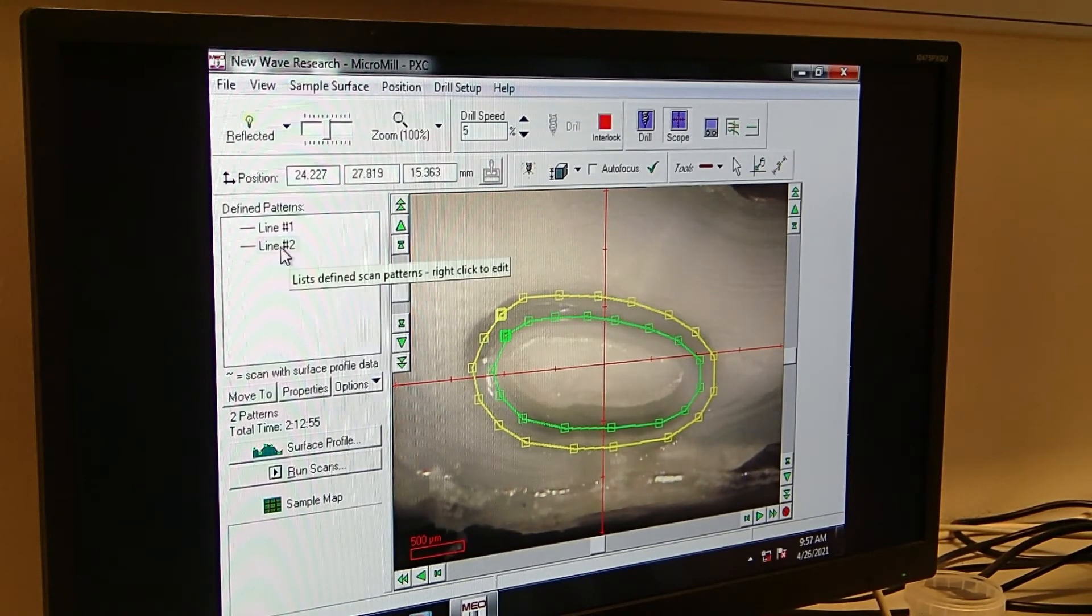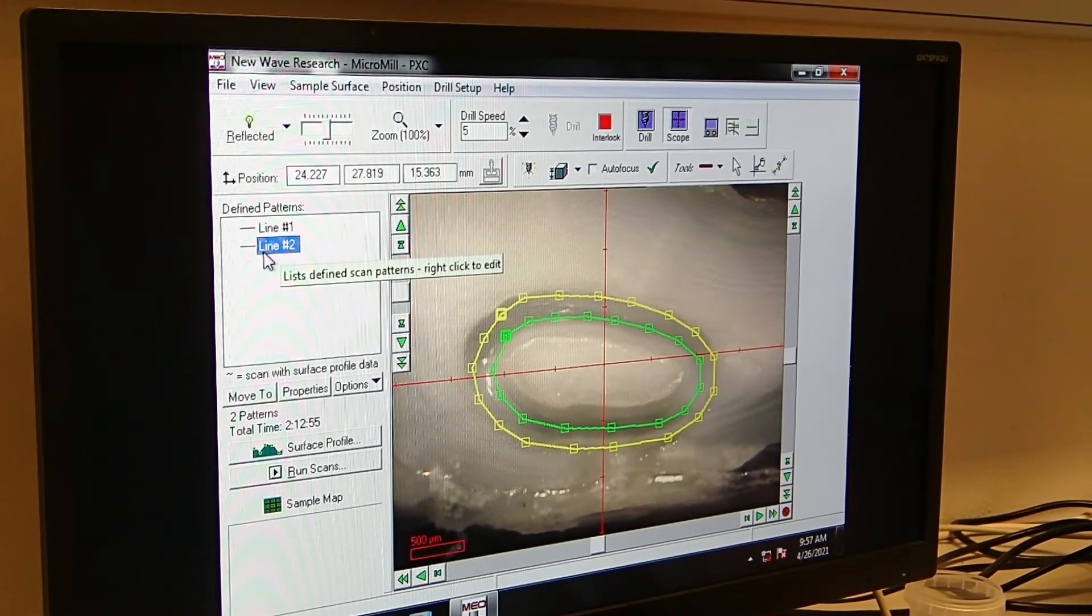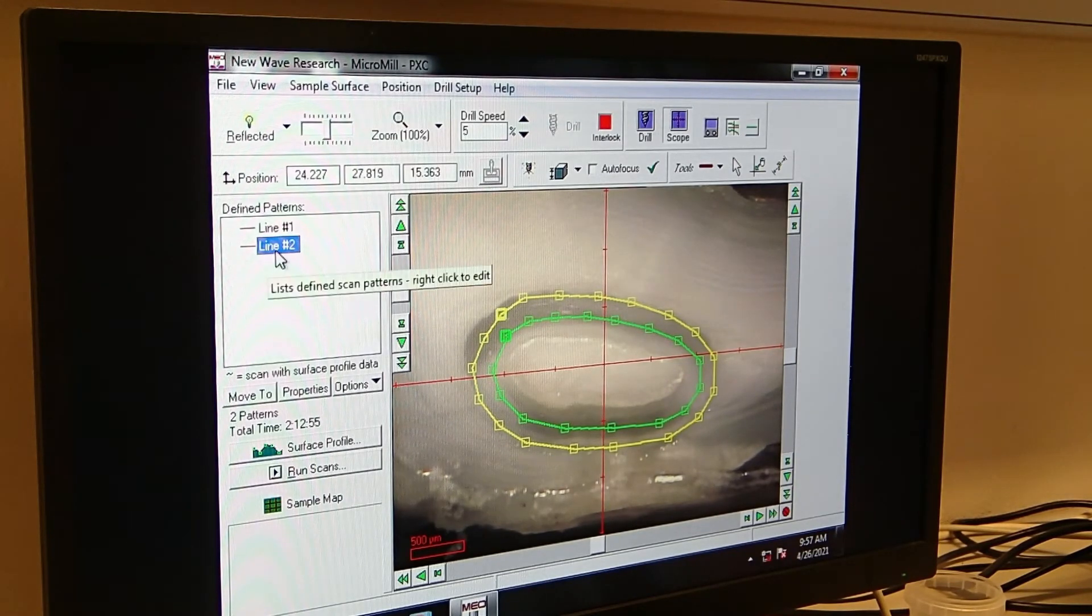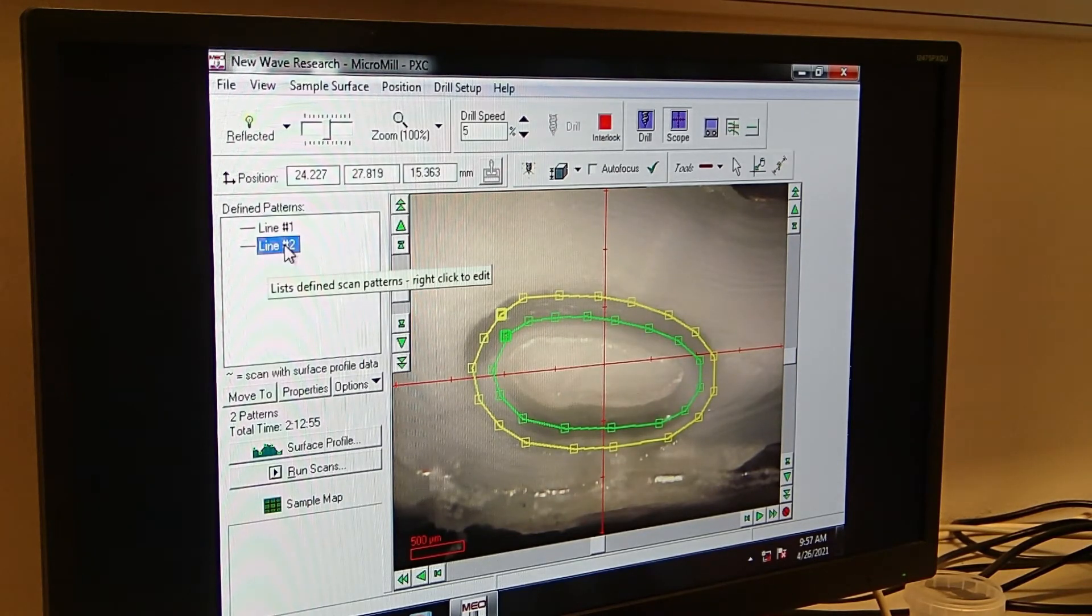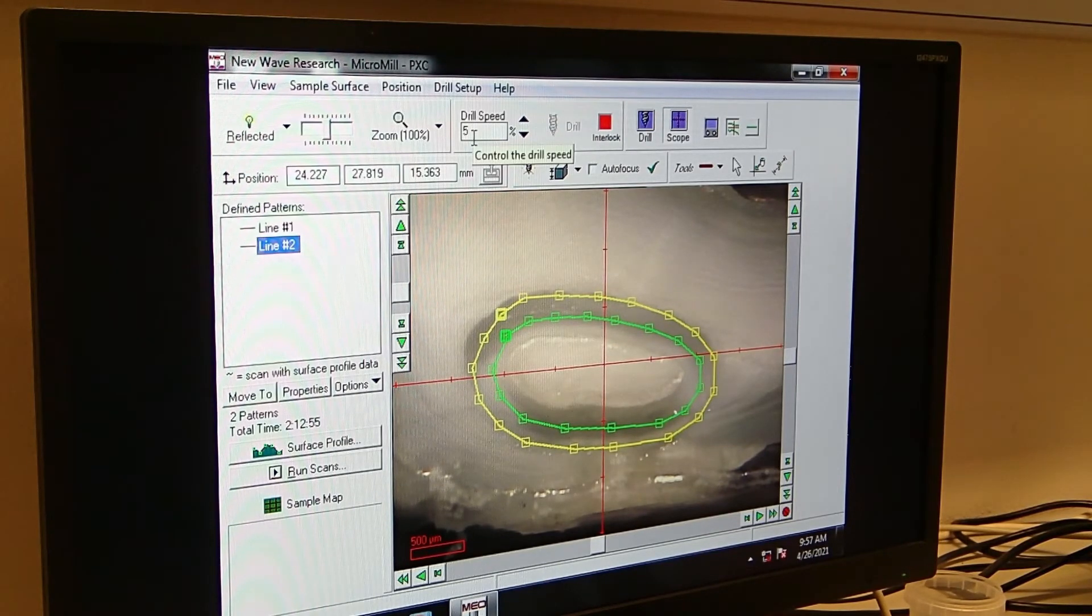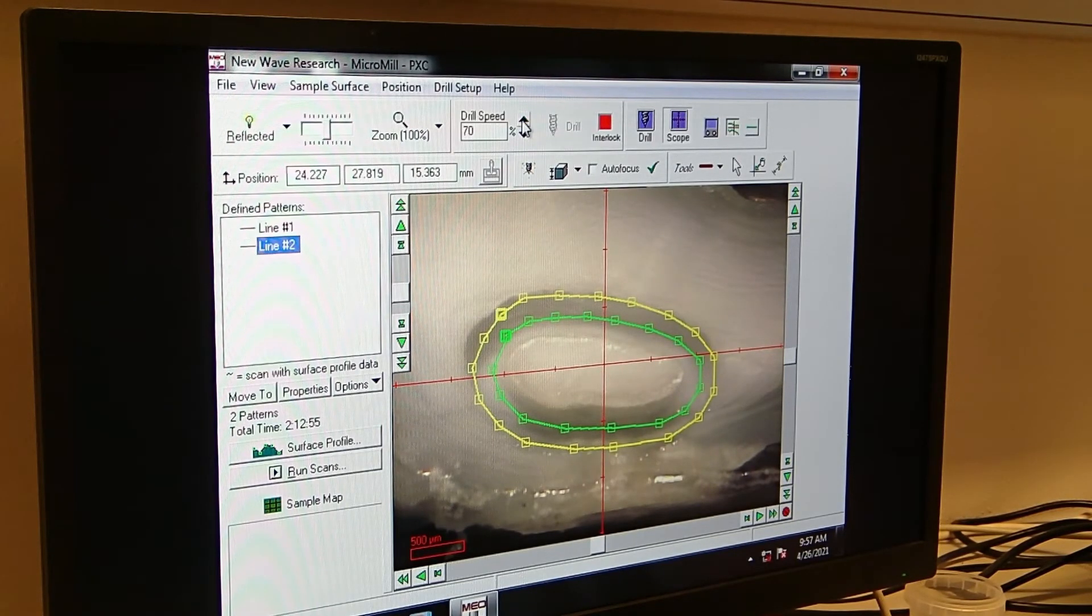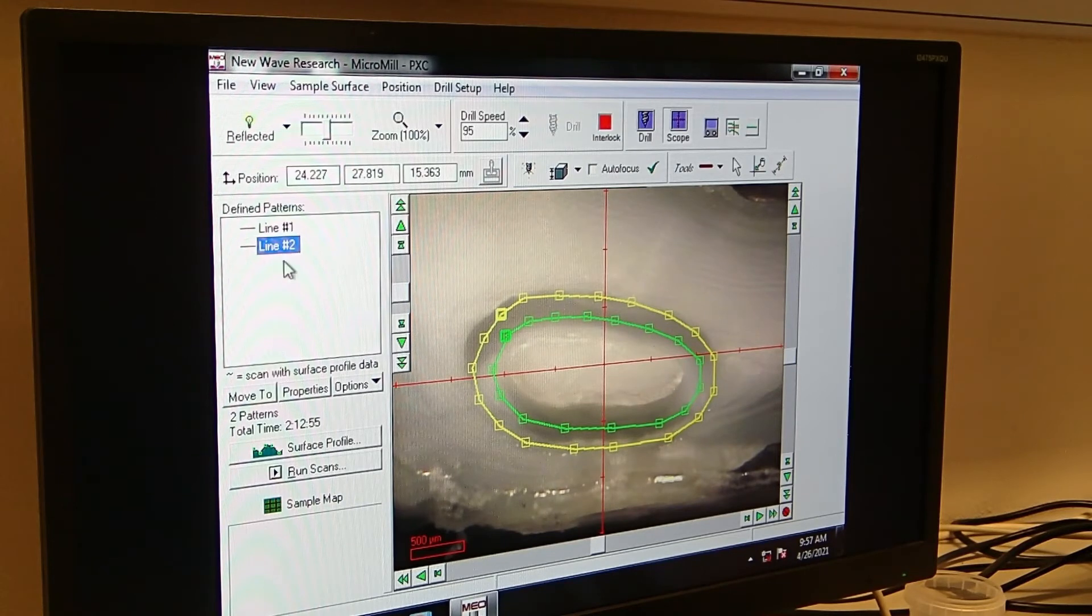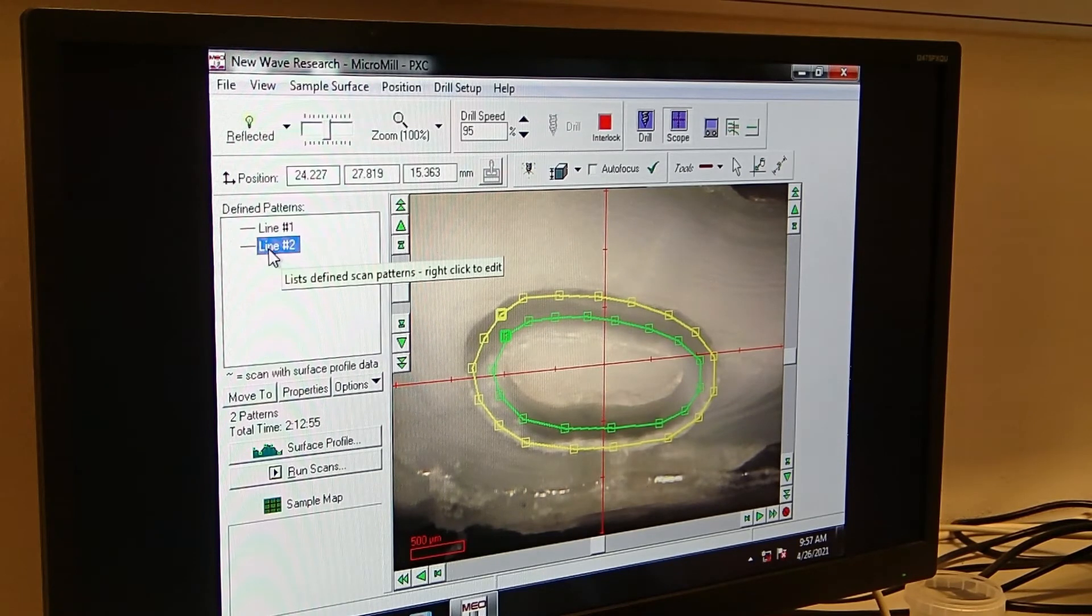So as I said, we do want to drill this outer line, which is here called line two. You can always see which line is the defined pattern because this is the one shown in yellow. And so before I start making some property changes here, it is important to increase the drill speed. It's always going down to five once you have closed the software, but we always want to drill within speed of 95%. So we just change it to 95 and it's going to be set to 95 until you close the software.